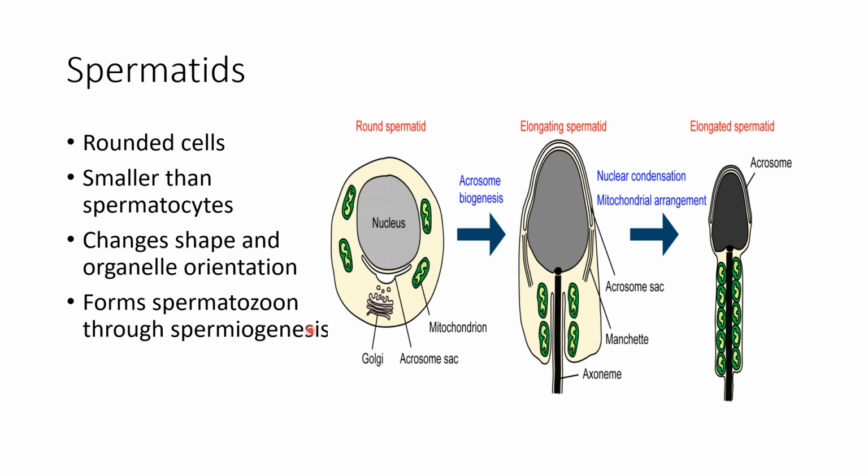The basic thing is to show you the microscopic features you get to appreciate at the level of the testis and spermatogenesis. Eventually the spermatid forms the spermatozoa through the spermiogenesis process. Spermiogenesis is when the spermatid is refined to become a full-blown, mature spermatozoa.